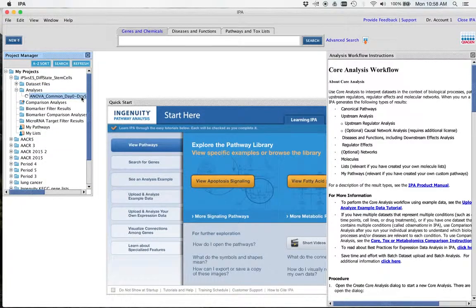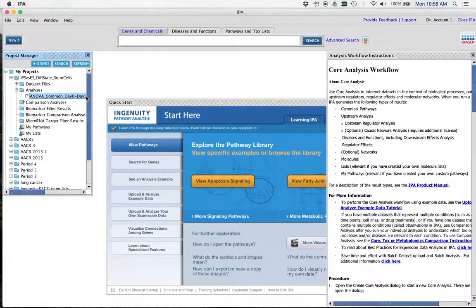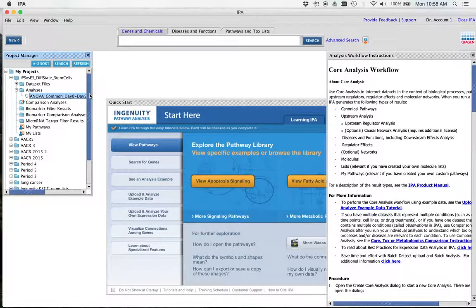And again, I would say for the fold changes, whatever your comparison is, if it's 0 to 5, use that fold change, or use that p-value. I think we should use all the same fold changes for all our gene lists. So be sure to select that column that gives a difference between iPS versus ES cells. All right, that's how you do it. I'll be in class tomorrow. Shoot me an email if you have any questions on this.